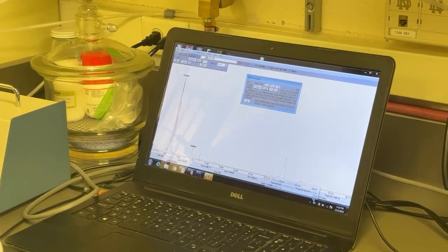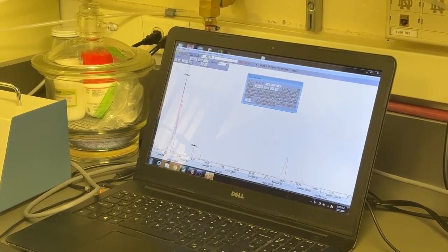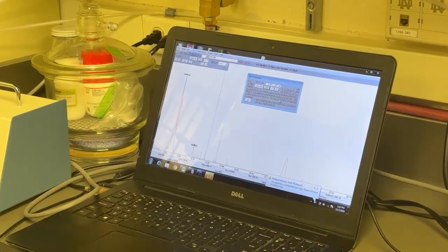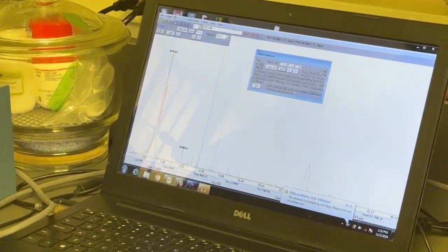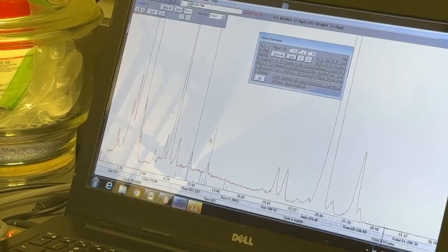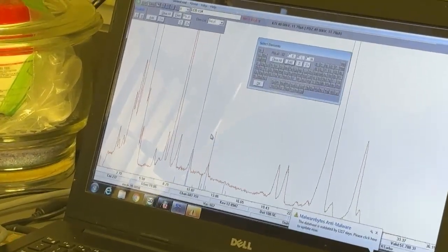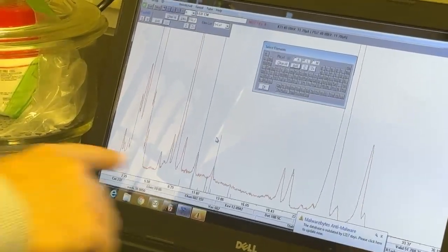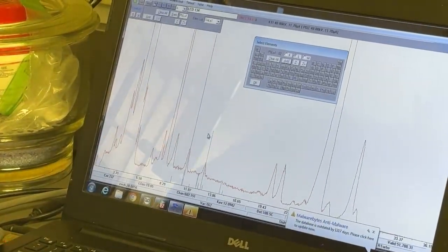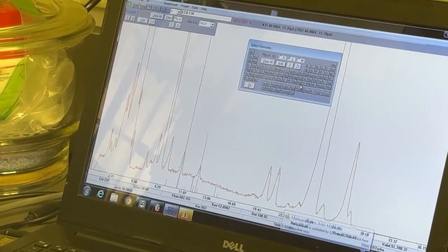But now if we go to lead, which is here, you see, there might be a very small possibility of some lead. Oh yeah, maybe, but it's not much. So we do have a small amount of lead. And you're sure that's lead and not antimony? Is there any other thing that could make peaks at those energies?